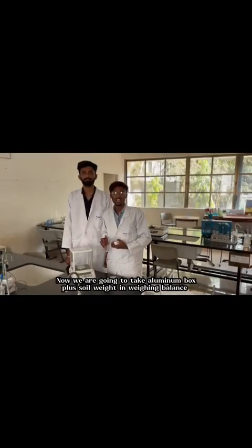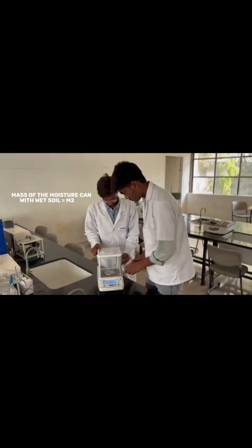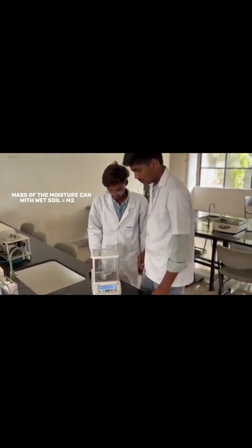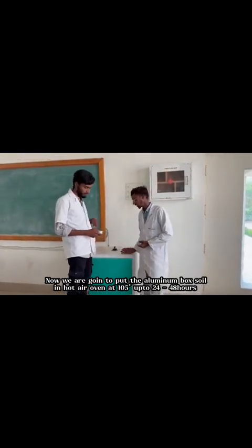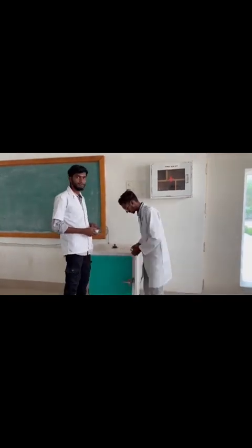Now we are going to weigh the aluminium box plus soil on the weighing balance. Now we are going to put the aluminium box with soil in a hot air oven at 105 degrees for 24 to 48 hours.